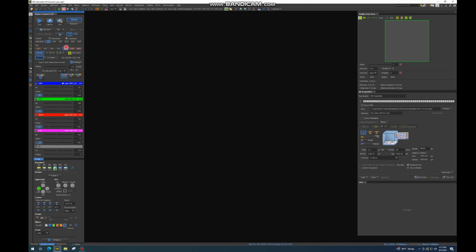So most people in the department have found the optimal balance to be 1/2 or 1/4 frames per second and a size of 1024. And this gives really nice high resolution images, and images of 1024 size are considered publication quality. Down here, we get into line averaging.